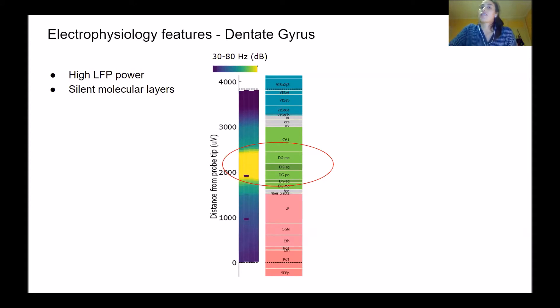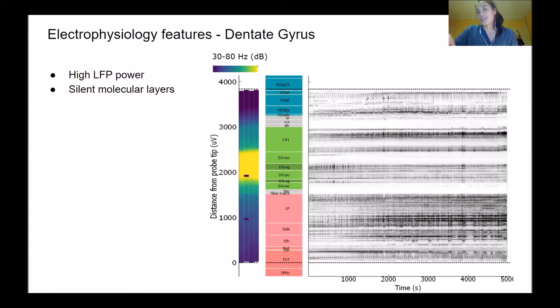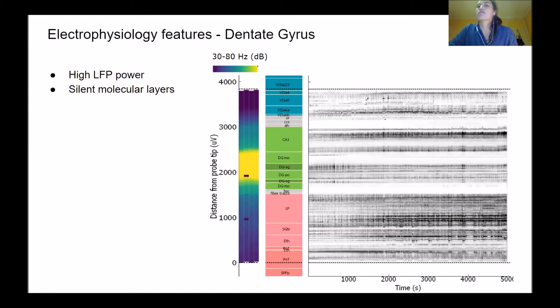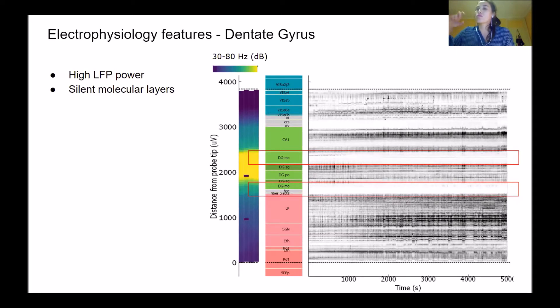Similarly, the dentate gyrus is often sandwiched by two molecular layers, where you expect to have little activity. If we look at the firing rate across the session, we have these two silent bands around. Those are useful landmarks to use for alignment.